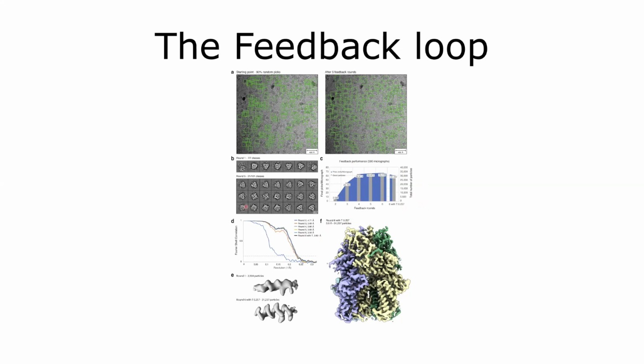With this help, we could get, live at the microscope, a resolution of 3.5 angstrom with this data set, which is actually pretty impressive, and only within a few hours after data collection started.